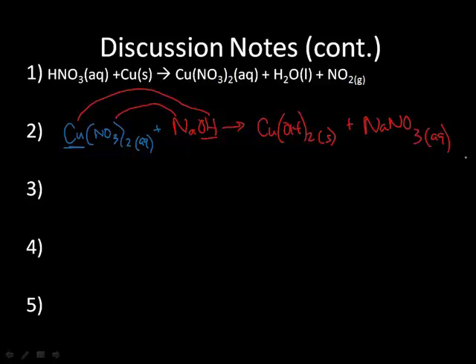The reason we know this is copper hydroxide is because it forms a blue solid, kind of gloopy stuff, more like a lava lamp. The sodium nitrate solution is clear and colorless, so that's the solution we see. The copper nitrate solution was blue, it goes to a blue gloopy stuff with a clear colorless solution, and sodium and nitrate are the one thing that's left over, so we put them in the second aqueous solution.